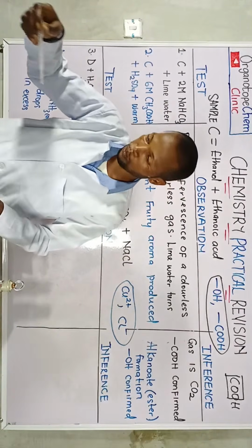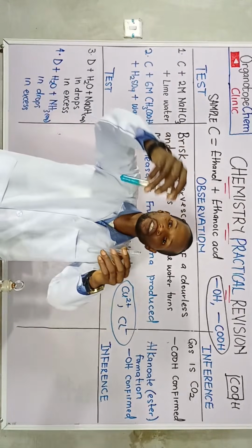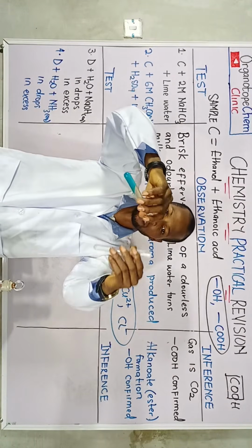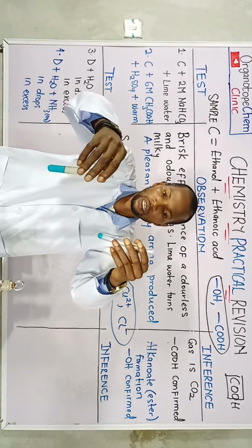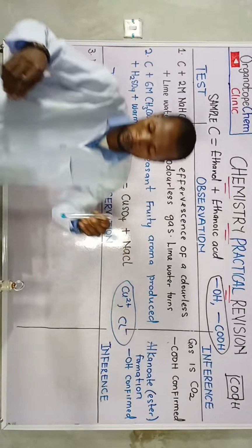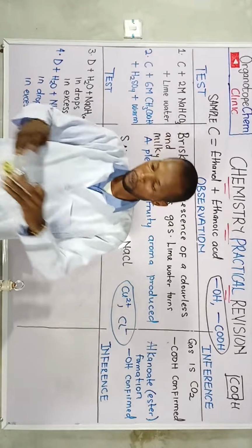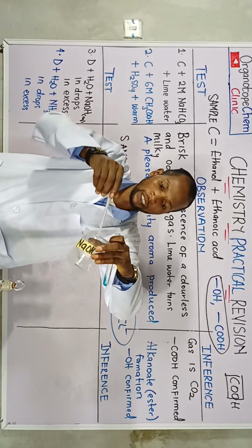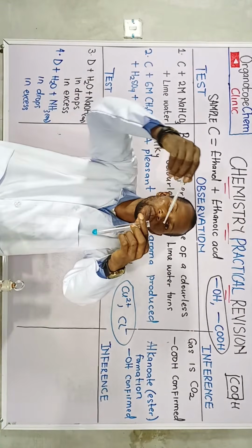Where is our first portion? So let's take the first portion. Just take little quantity, can you see? Take little quantity inside another test tube. This is an empty test tube, okay? So this is enough. Then the next thing is to add the sodium hydroxide in drop. So I want to take with the bad dropper again. And you see I will slant it. Now in drop.